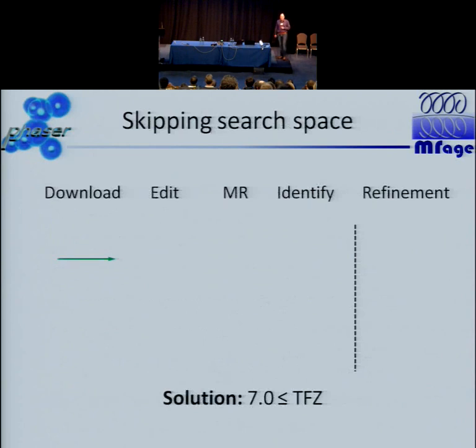So say we have found the first correct solution. What can we do with this? The first thing is we can actually stop searching, because we do not want to find another correct solution, because that would just cause more trouble than good. The question is whether we can do this in a feasible way that is also computationally efficient.